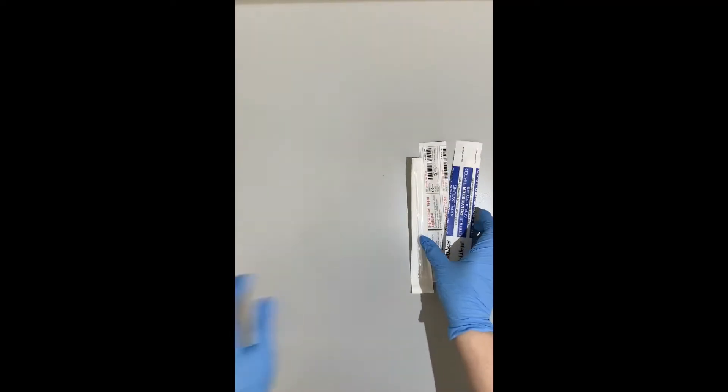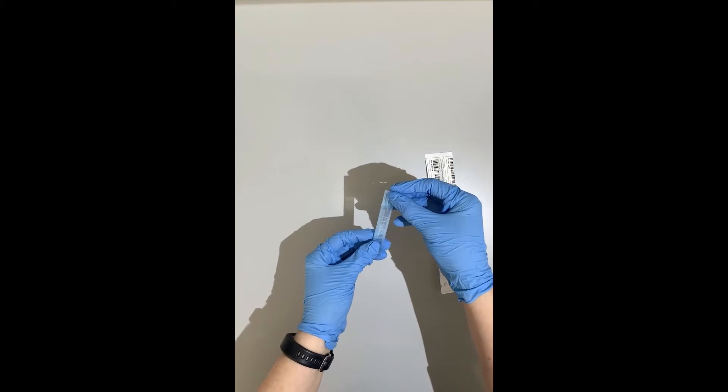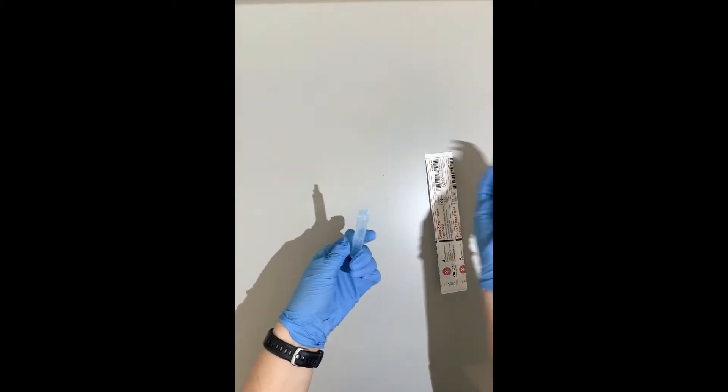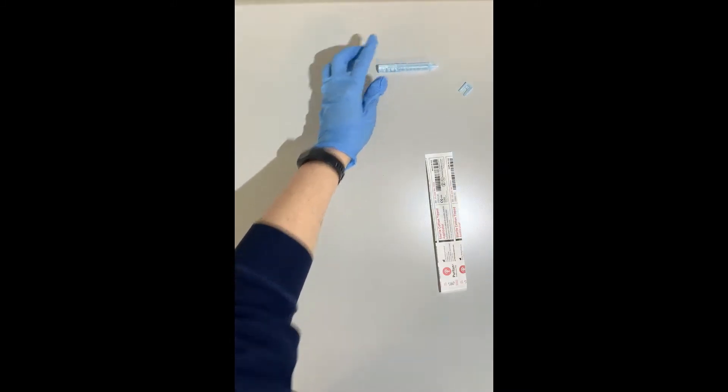Once you've selected the type of swab you're going to use, you'll also need sterile water. They come in little vials that look like this and you can twist the top off and you can have sterile water for the course of that collection at that one crime scene.